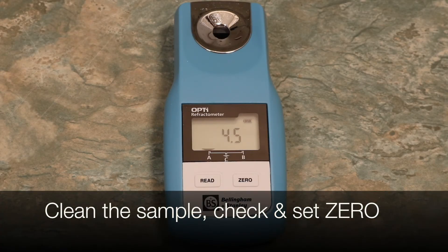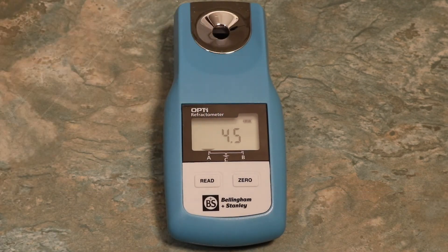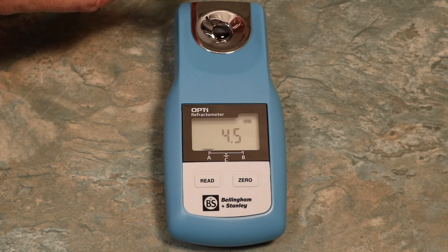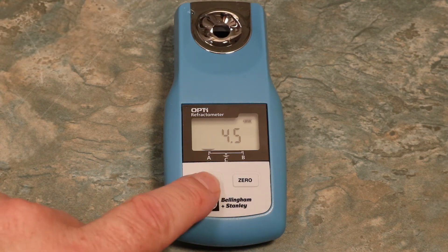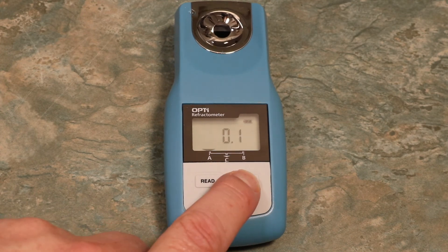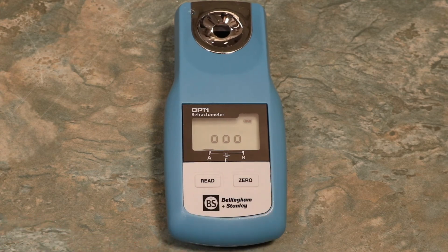To perform a Zero calibration, clean any remaining sample from the refractometer using a clean tissue. Apply some filtered or distilled water. Press Read to confirm whether it requires a Zero. Our example shows a reading of 0.1, which means we need to zero calibrate. Simply hold the Zero button down for three seconds until a row of little zeros appear, then press Read to take a reading. When 0.0 appears, the instrument is calibrated.